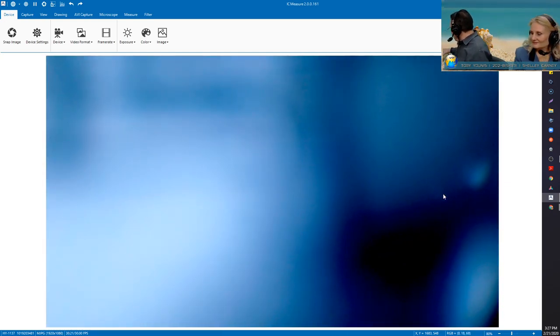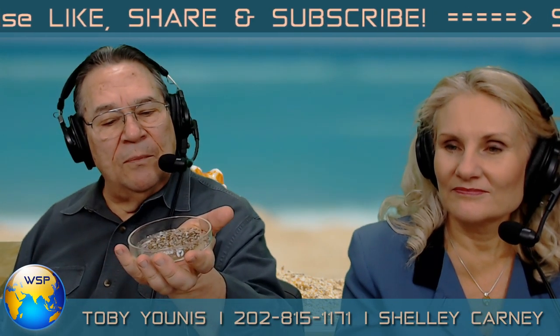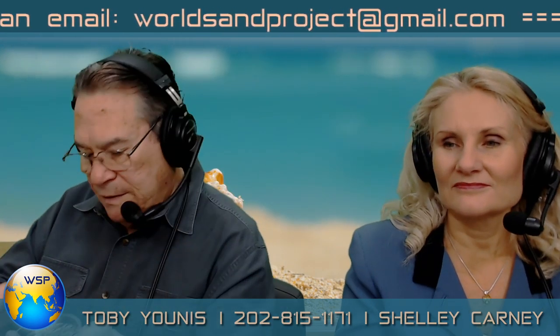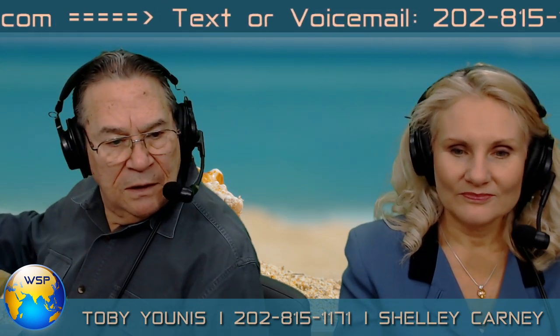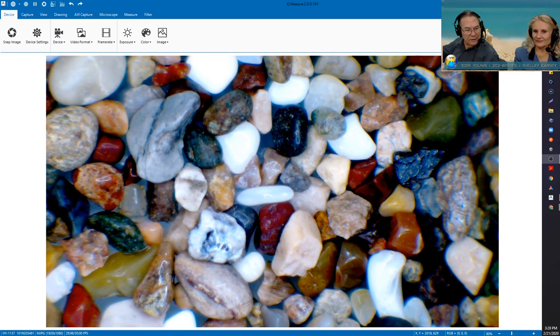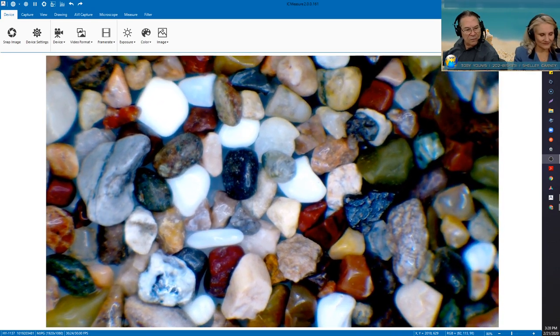When I'm looking at a sample under the polarizing microscope, so I can get the light on it in an even way, I usually put it in a petri dish so it's just one layer of sand. So let's put that under the stereo microscope and see if we can identify anything. I'm just going to scroll around this one layer and see if there's anything of great difference or interest.